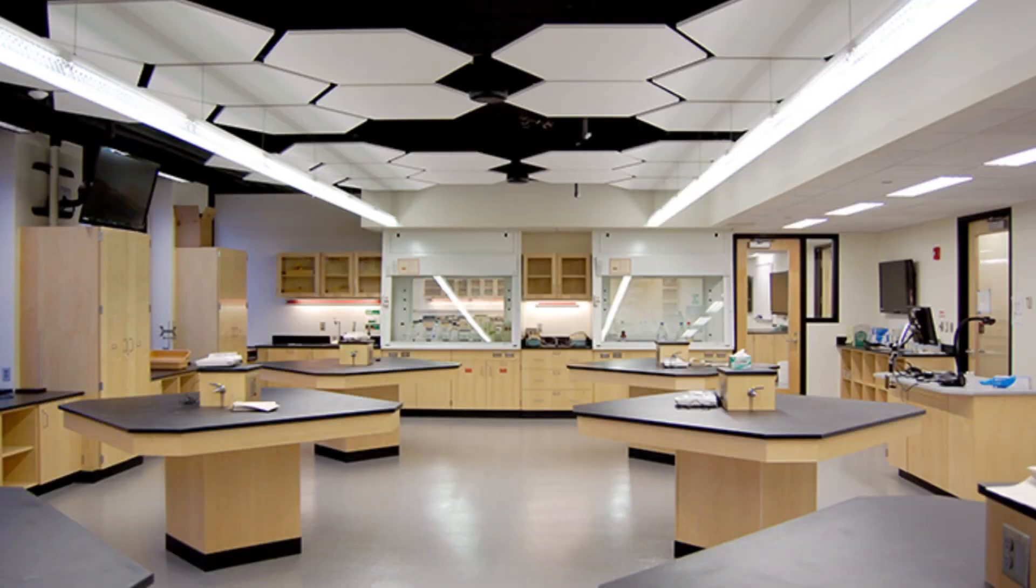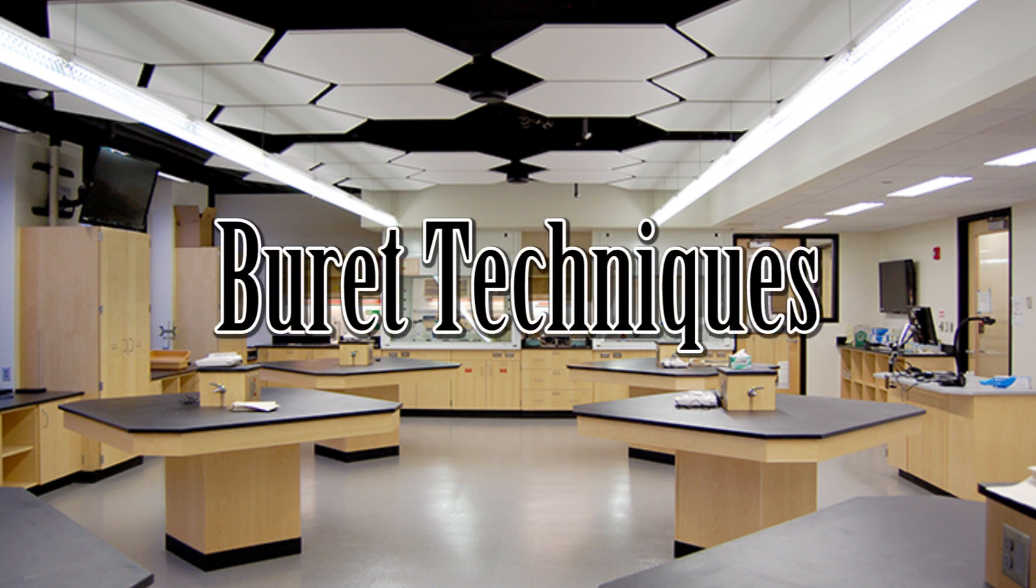Hello and welcome to the UNL Chemistry video series. In this video we are going to go over the proper techniques for using a burette.